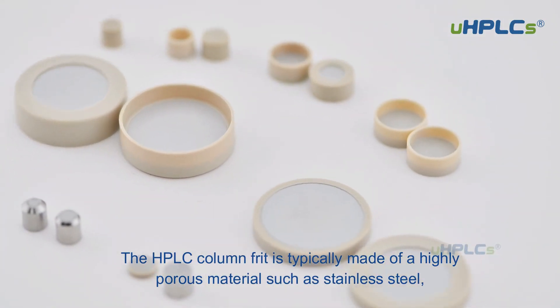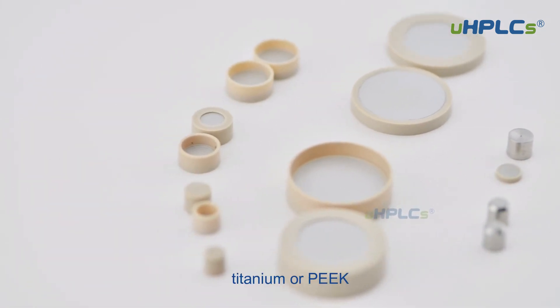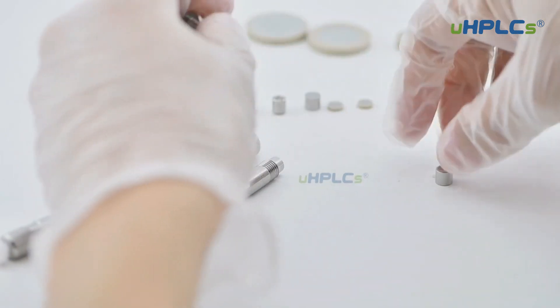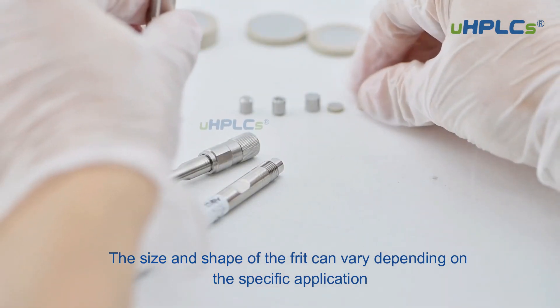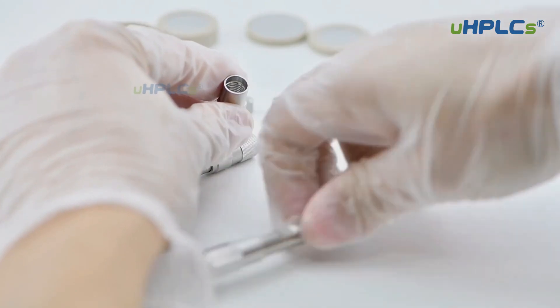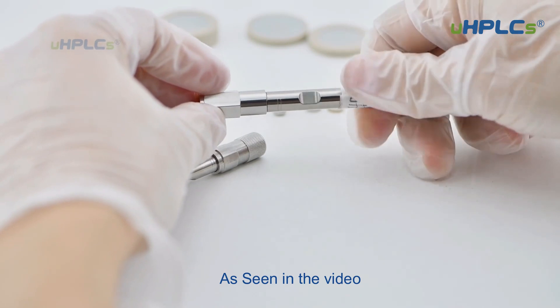The HPLC column frit is typically made of a highly porous material such as stainless steel, titanium, or PEEK, which is resistant to high pressure and chemicals. The size and shape of the frit can vary depending on the specific application and the type of column being used. Some common shapes include discs, cones, and cylinders, as seen in the video.